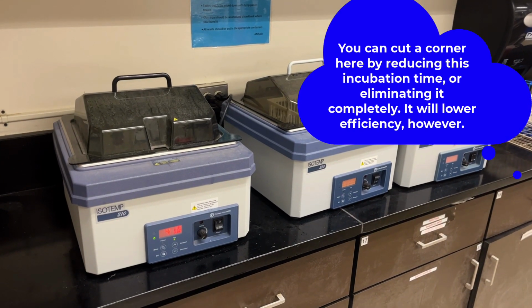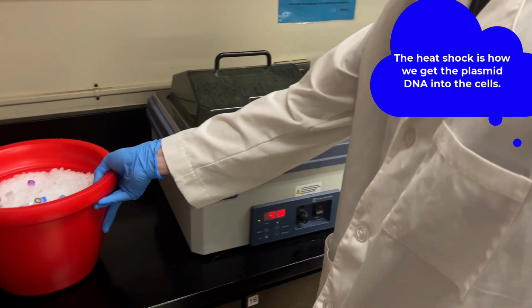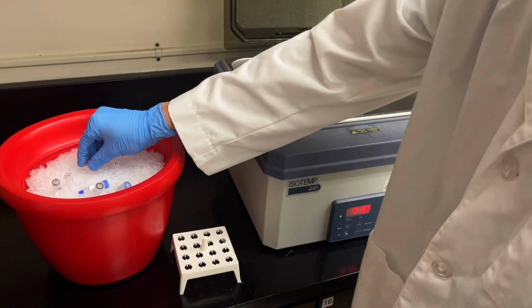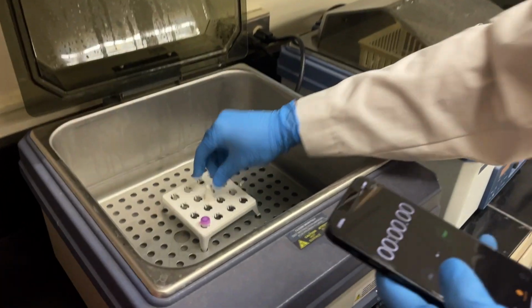After incubation comes the heat shock. Bring your cells to the water bath. There's generally going to be a rack like this that floats. If this one isn't present, there are others available. Have your timer ready. Place your cells in the rack and then 45 seconds.